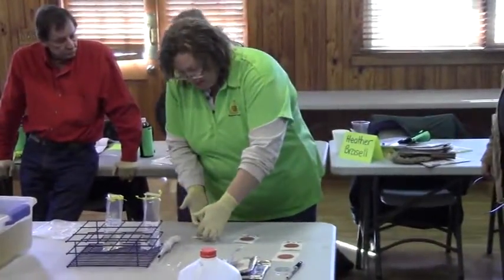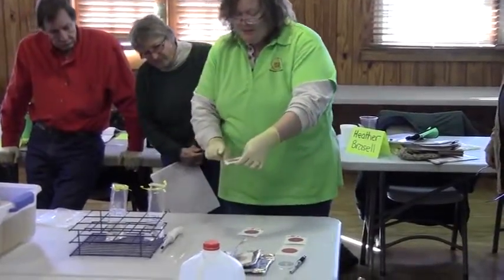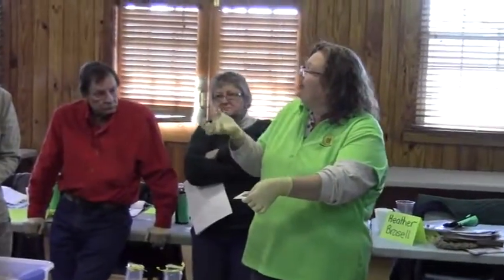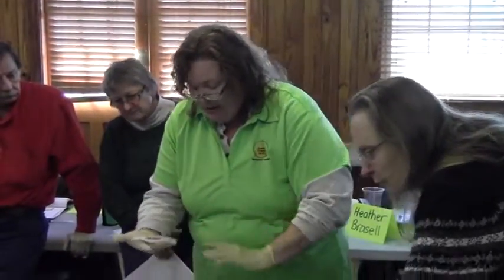Once that has set up for a few minutes, we very, very gently come up and try not to do what I just did, which is to hit that piece. Because whenever you lift this up, it's introducing and pulling the medium off of there, and then the bacteria have nothing to eat. So it kind of skews your numbers. Once it's set like this, you don't want to be flipping the paper up and down on it. You just want to very, very gently let it set.